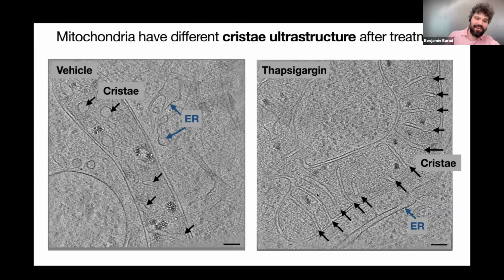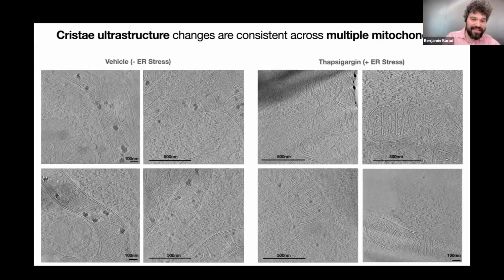There's a downside though, which is, I don't know how many of you are cell biologists or even if you read cell biology papers, but no 2 cells are alike. No 2 mitochondria are alike. They're each their own special snowflake. And so taking one picture of a mitochondrion does not teach you mechanism. What we need is to be able to take lots of pictures of mitochondria. And when you do that, you can begin to see patterns. But the problem then becomes, how do you convert these things that you see into quantifiable observations? Most importantly, observations where you can say, yes, this is a statistically significant change and not just the random distribution of mitochondria we happened to sample.